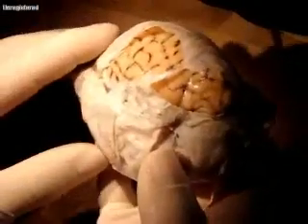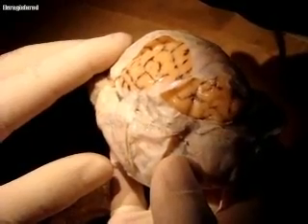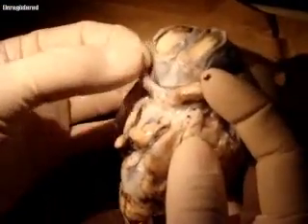That region that goes down is called the falx cerebri, F-A-L-X C-E-R-E-B-R-I, the falx cerebri. So the first thing that we're going to want to do, well, actually we can look at the bottom first, and then we'll cut it in half. So looking at the very bottom of the brain then, you're going to see something really obvious. You're going to see this thing that kind of looks like it has a mustache.